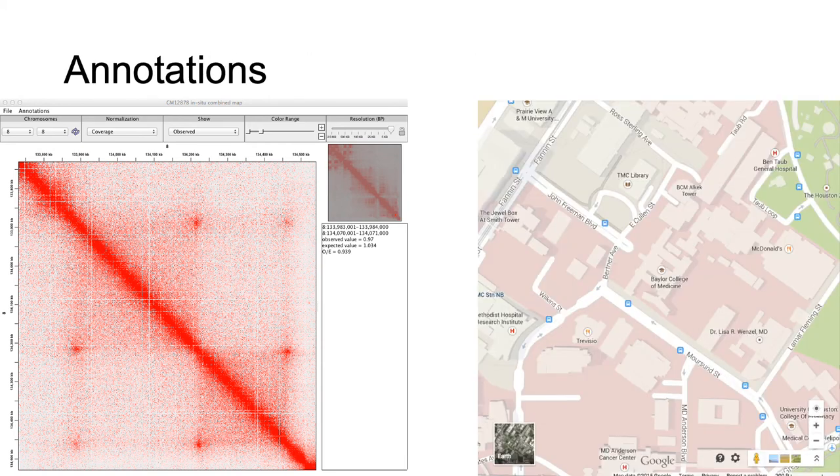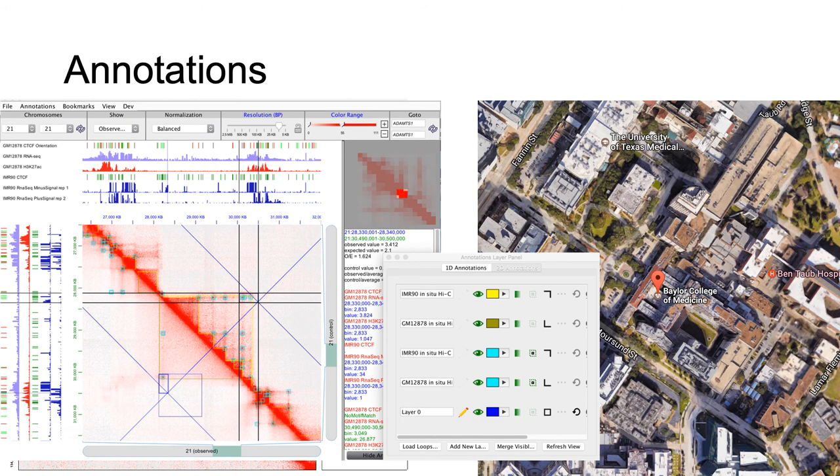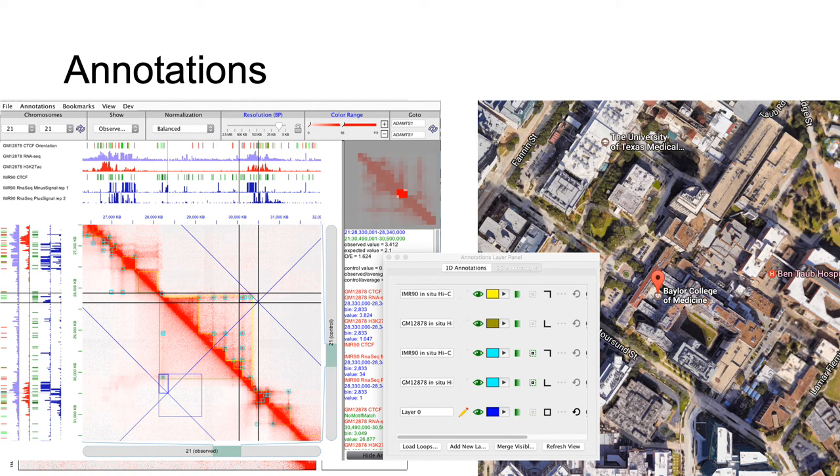We also have the ability to annotate our contact map, the equivalent of a labeled map as opposed to a satellite view. These annotations come from encode datasets such as ChipSeq tracks and domain-in-loop annotations, as well as user-defined, hand-drawn annotations.